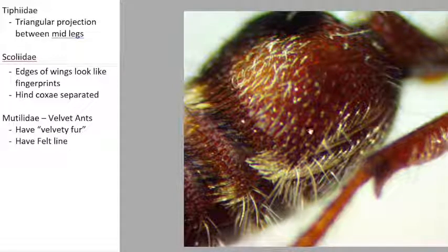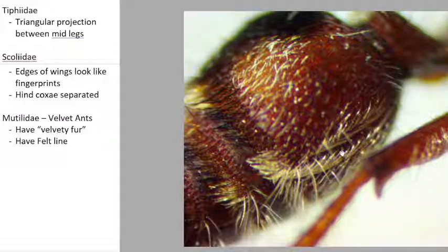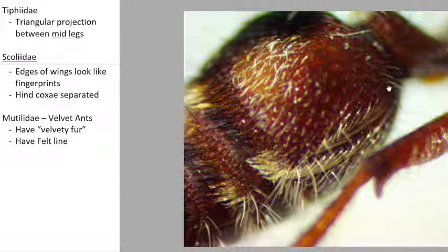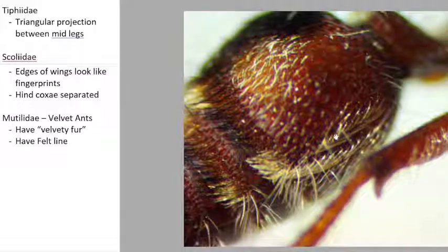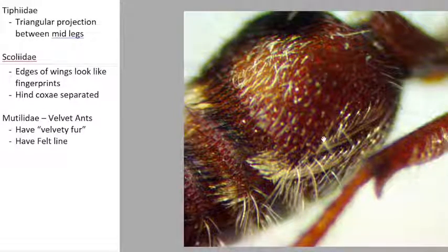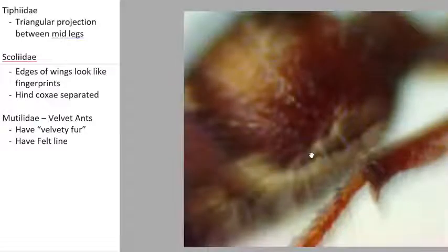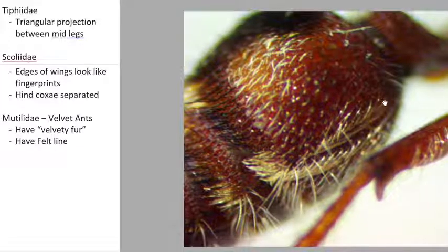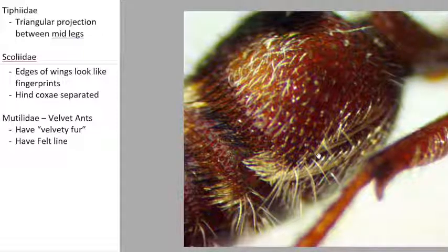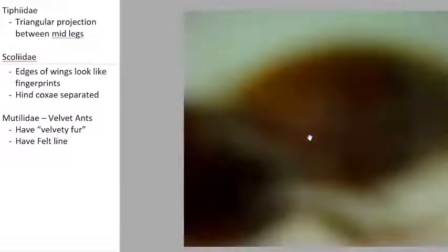All right. So that's the characteristic you're looking for, outside of knowing that their coxae are close to each other, so they are going to be touching, unlike the scoliids. And they all have the felt line, except sometimes it is a little bit more difficult to see, just because they tend to be so setose, or so hairy, that it is more difficult to see a line of even more hairy spots, right? But this one seems to be pretty obvious. You've got that nice little felt line right there. So if we were looking at this other specimen that we tried to see it in the first one, let's see.